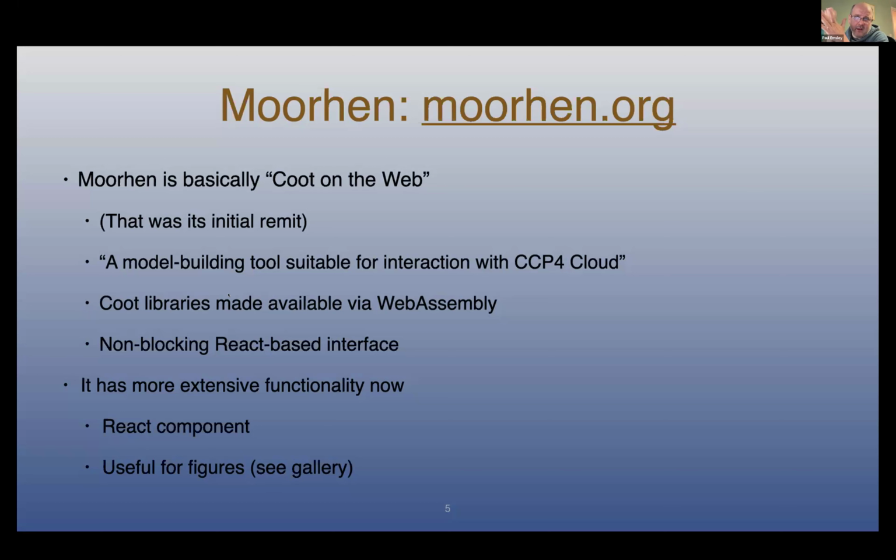Now, this is exactly the same split that was needed to get Coot working with VR as well, or any kind of external representation. So there's maybe low-hanging fruit there for representation of Coot molecular properties in VR at some stage, although that's less trendy than it used to be.